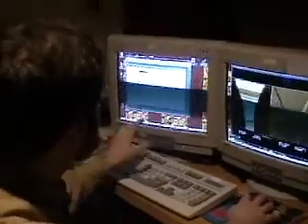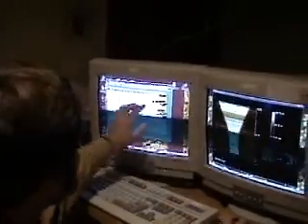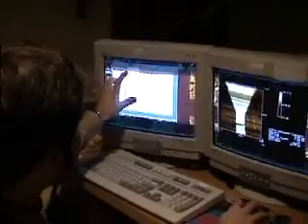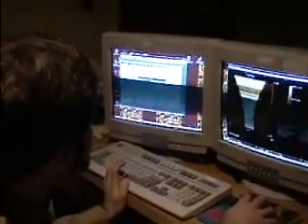And to do that, I go to Image, select Left Image, let's say if I want to look at the height image. And then in order to do the line-by-line plane fit, I click on the rolling pin icon, which stands for Flatten, or I can go to Modify, Flatten. Those are two equivalent operations. So I'm going to click on the rolling pin icon.